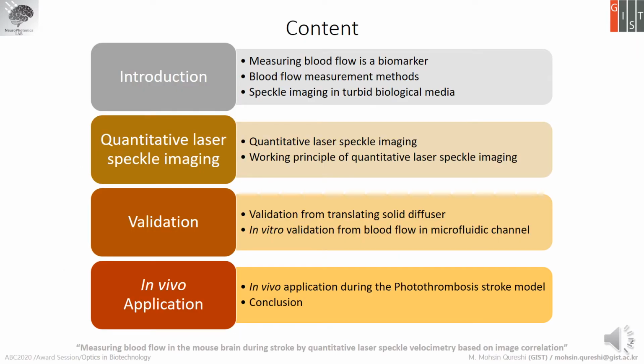So here are the contents of the presentation. This presentation is divided into 4 parts. The first is the introduction, the second is quantitative laser speckle imaging, and then we will validate it through a solid diffuser and RBCs in a microfluidic channel, and last is the in vivo application of this procedure.